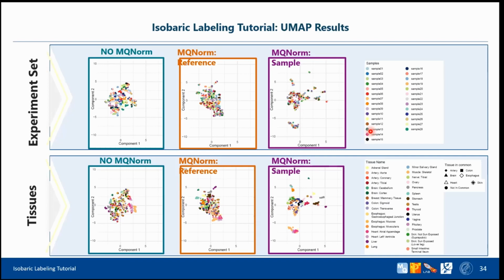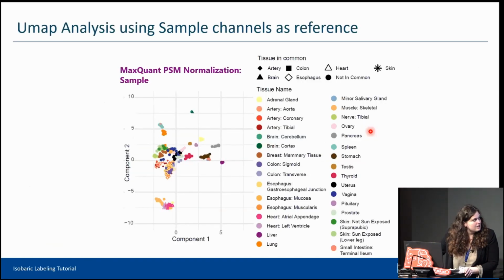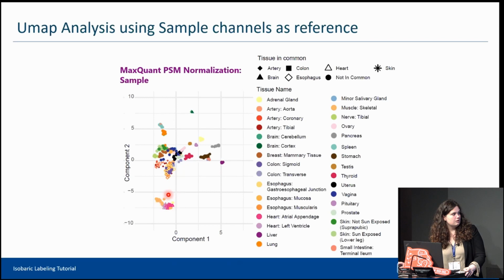So we thought, okay, maybe this one is clustering based on something else. We colored based on tissue, and indeed you can see that it starts to cluster based on that. If I zoom in, you can see exactly that it starts to cluster. You can also see, with the pointer, this triangle, which are 2 different regions of heart.